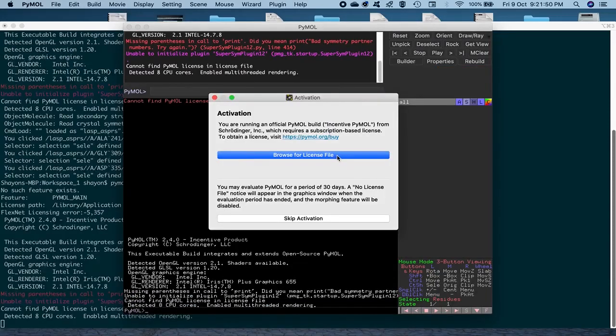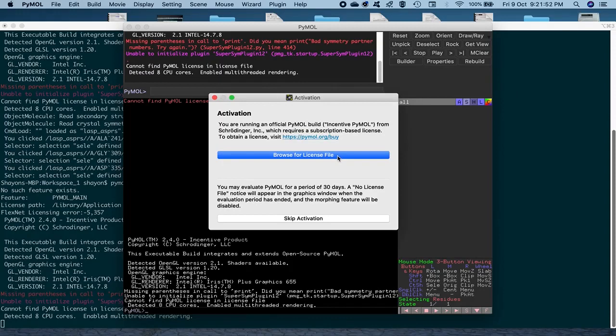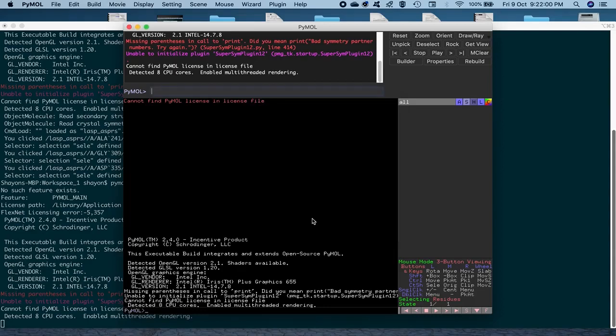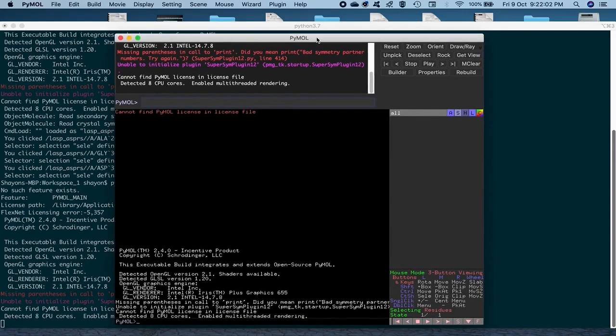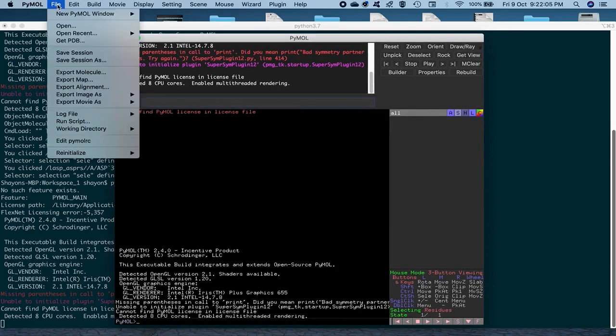And then it asks you to buy a paid version, but you really don't need that because the evaluation version is good enough and it has got a lot of capabilities and functionalities. So we are going to skip this activation out here.